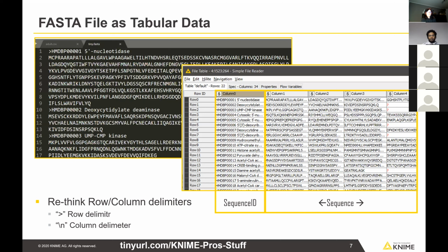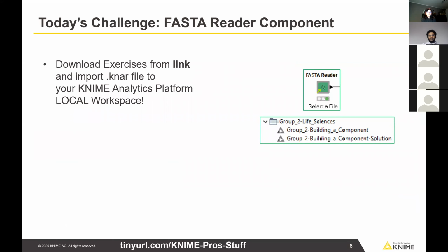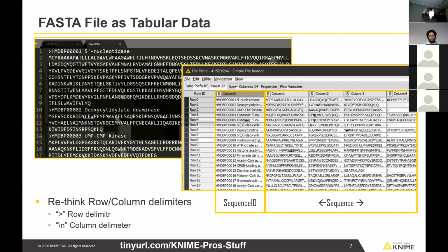This is what we are going to do today, to create a FASTA reader component that can handle multi-line FASTA files, multi-line FASTA entries, and that can give us also some error messages whenever the file format is not what we expected.